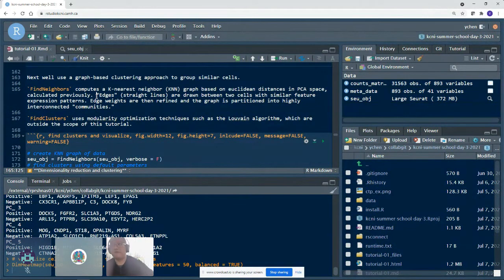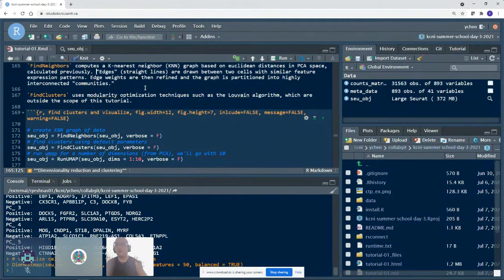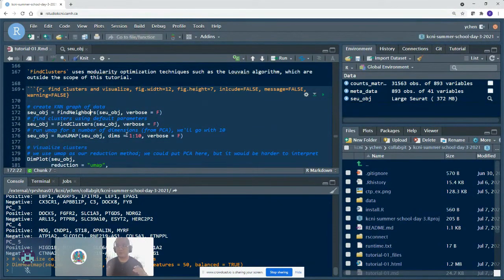Now we are going to find and define cell types and groups. And all it really is, is clustering, right? If you've worked with cluster analyses in a different context, we're going to be doing something very similar. We are not going to be using, for example, a centroid-based clustering method, but somebody could be using something like that. For those of you who are not familiar with clustering, I will go into a little bit of what we are doing. But again, for our purposes in this tutorial, it is sufficient to understand things at a high general level.